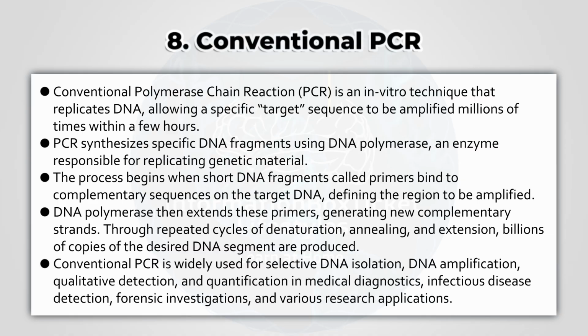Conventional PCR is widely used for selective DNA isolation, DNA amplification, qualitative detection, and quantification in medical diagnostics, infectious disease detection, forensic investigations, and various research applications.